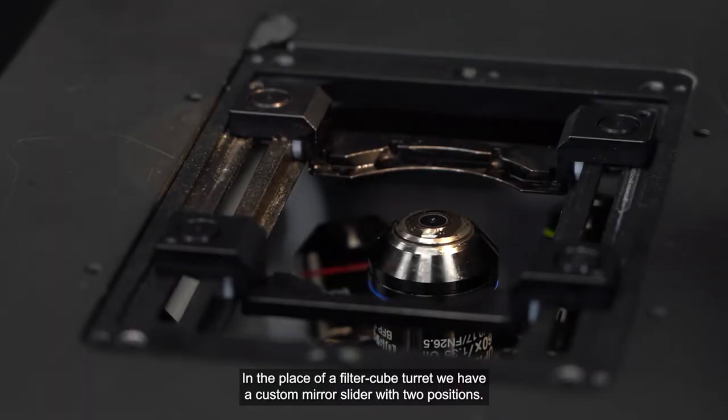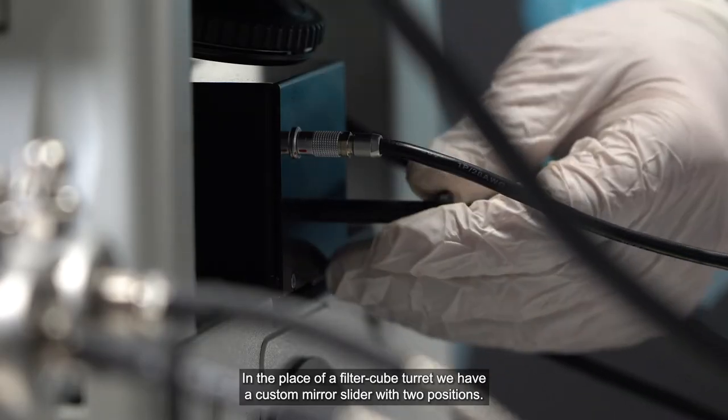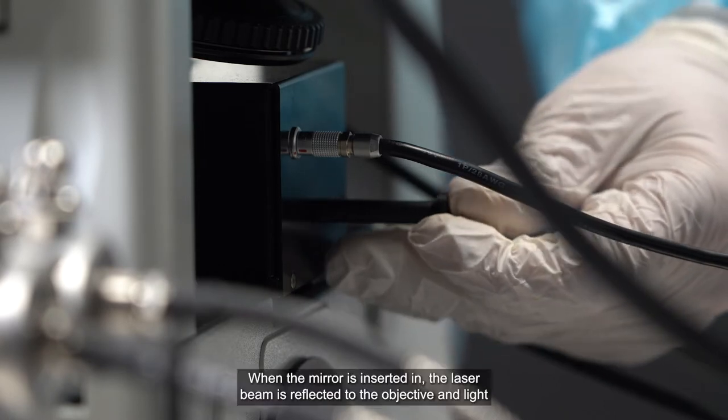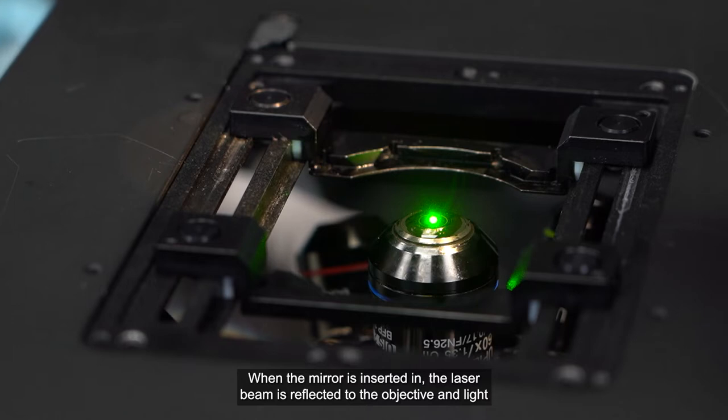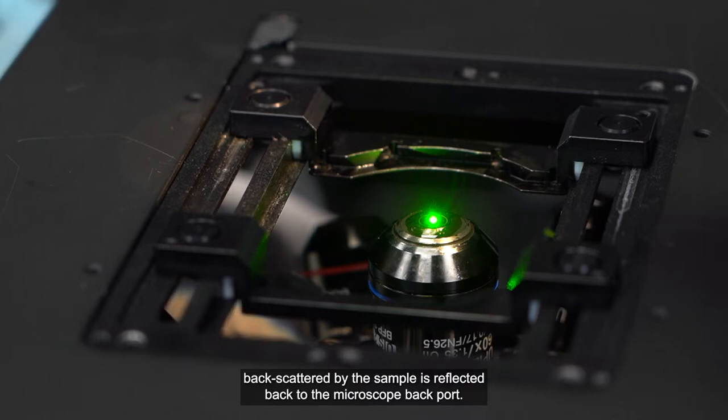In the place of a filter cube turret, we have a custom mirror slider with two positions. When the mirror is inserted in, the laser beam is reflected to the objective and light backscattered by the sample is reflected back to the microscope back port.